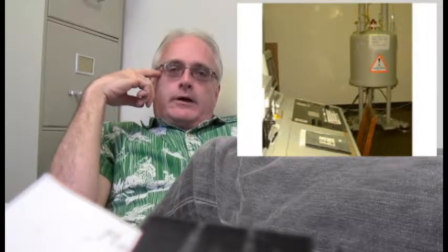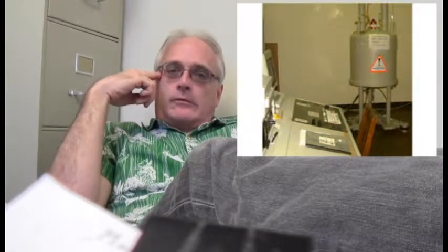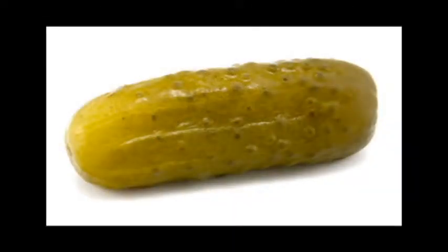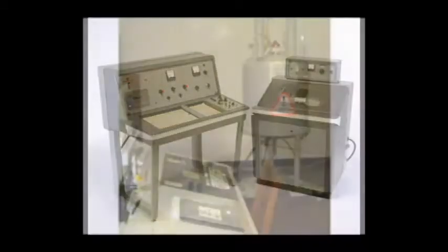I had a graduate student run it on our new 250 megahertz superconducting magnet, and we got a value for the methyl group of methanol at 250 megahertz. So I guess that must be the right value. So the NMR community finds itself in a bit of a pickle. After all, two different researchers have measured the same molecule and found resonant frequencies that are quite different from each other. I know, it's shocking.